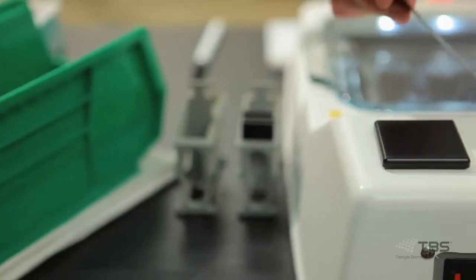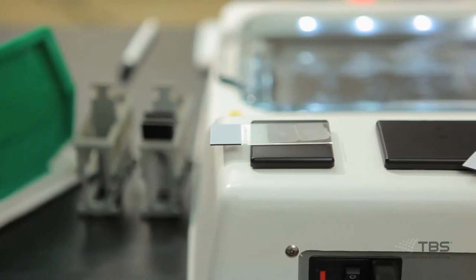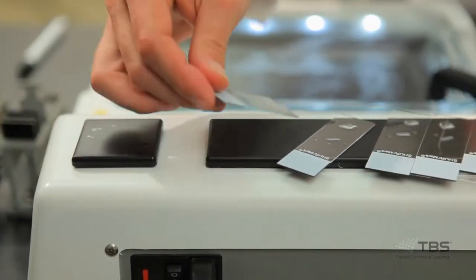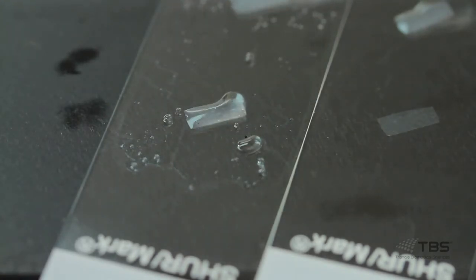The FWS series includes a histo orientator and slide dryer. A quick touch of a slide to the histo orientator minimizes wrinkles, and the 2x8 slide dryer is conveniently located to begin the slide drying process. The more economically priced TFB series includes all of the same features as the FWS models but without the histo orientator and slide dryer features.